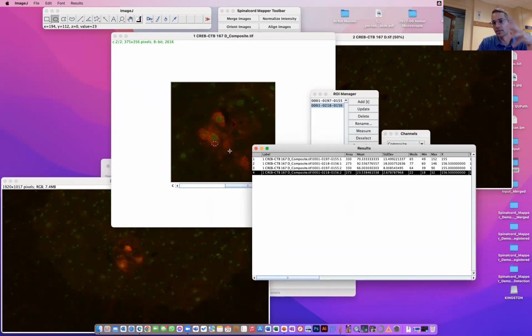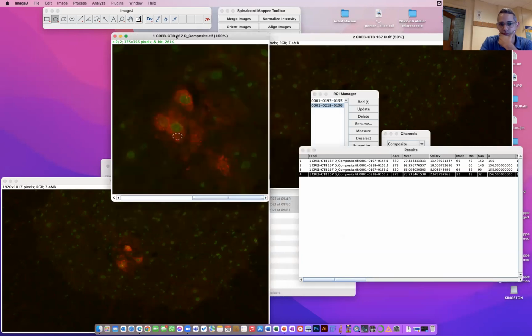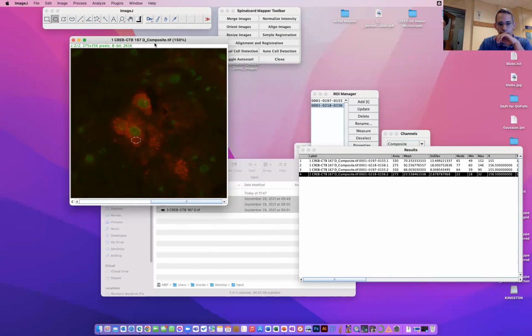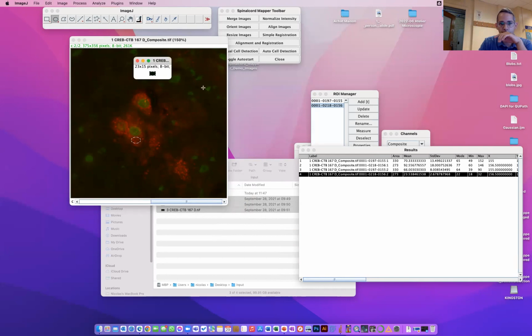So you will have to segment the image because it's not possible to draw a single region of interest. For me, I created the mask to create CTB. And then after I create another mask with the green, and I merged them. So it gave me only the mask in the red. Okay, but so you can determine the threshold, not threshold, but the density of green.